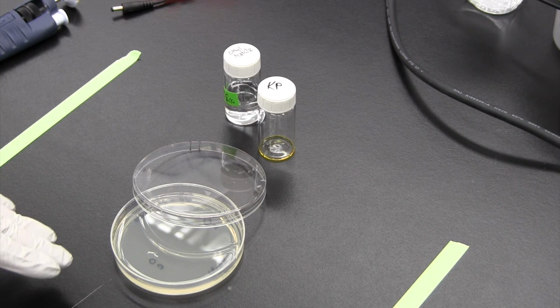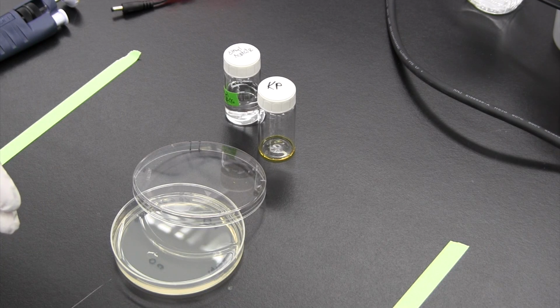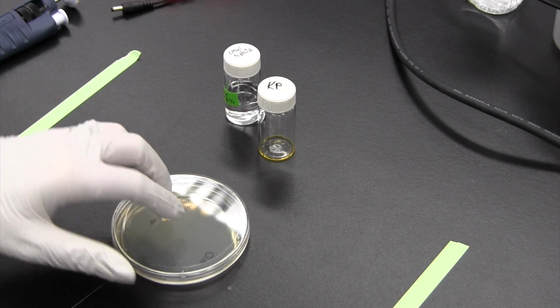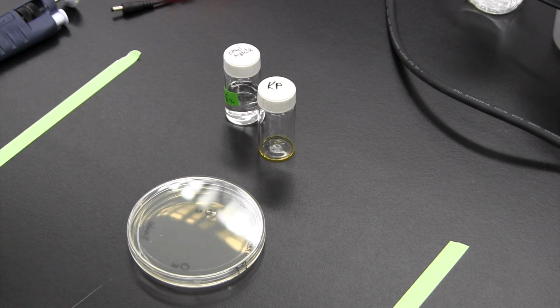As soon as that dries off, which should take a couple of minutes, we would add the second and then the third spotting of our ethyl acetate. For demonstration purposes, I'm just going to turn the plate and we're going to add 10 microliters of our extract to the other side.